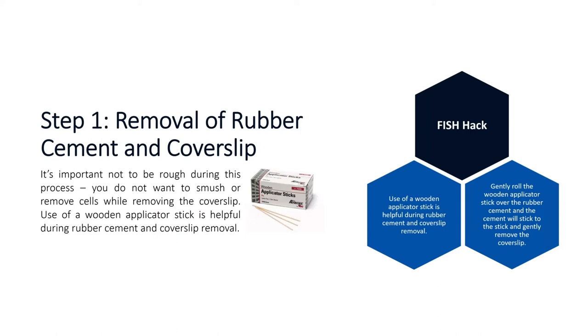Here's a FISH hack for step one: removal of the rubber cement and cover slip. This is important because you don't want to be rough — if you are, you can smush or remove cells. You can use a wooden applicator stick to remove the rubber cement and cover slip. Just gently roll it over the rubber cement; the cement sticks well to the stick and also gently removes the cover slip. You can use one stick for all your slides — it forms into a big rubber cement lollipop — and you can use one stick for 20 different slides.